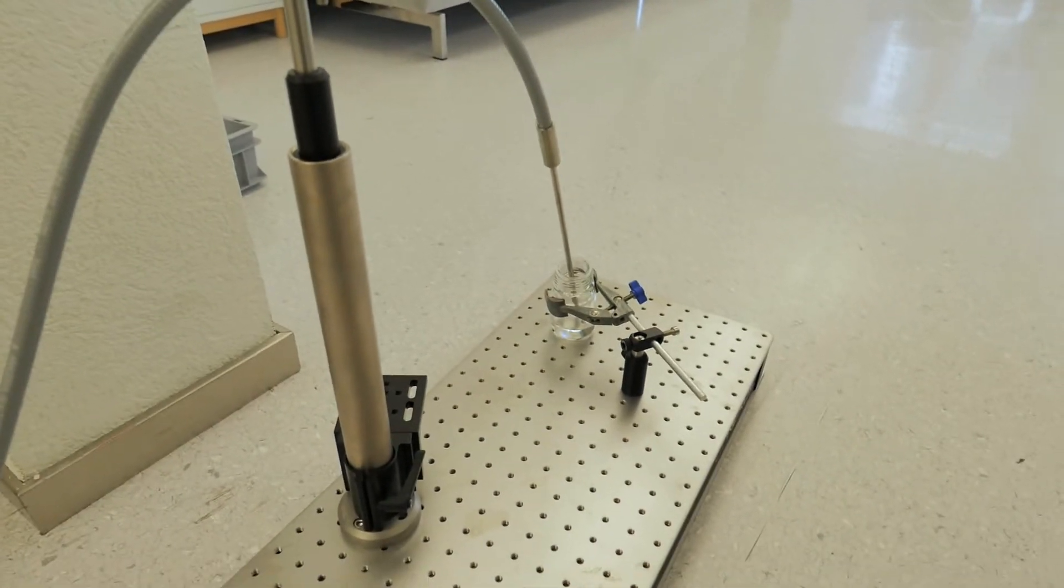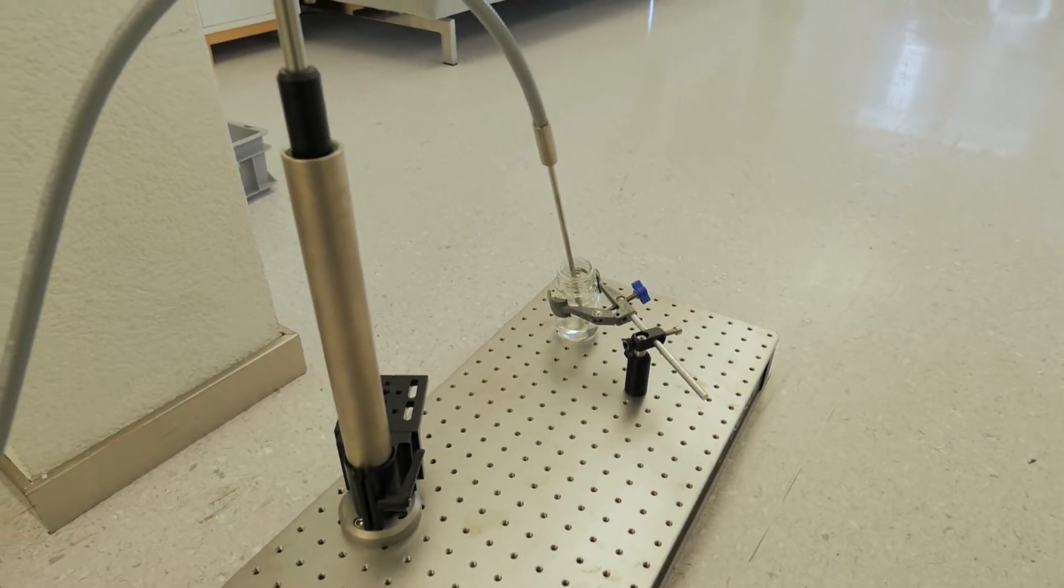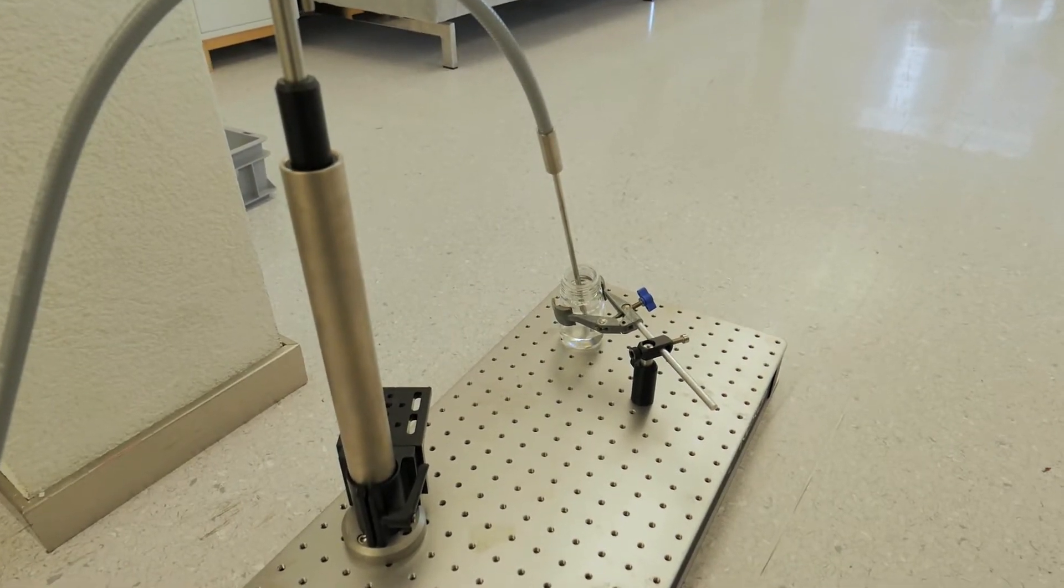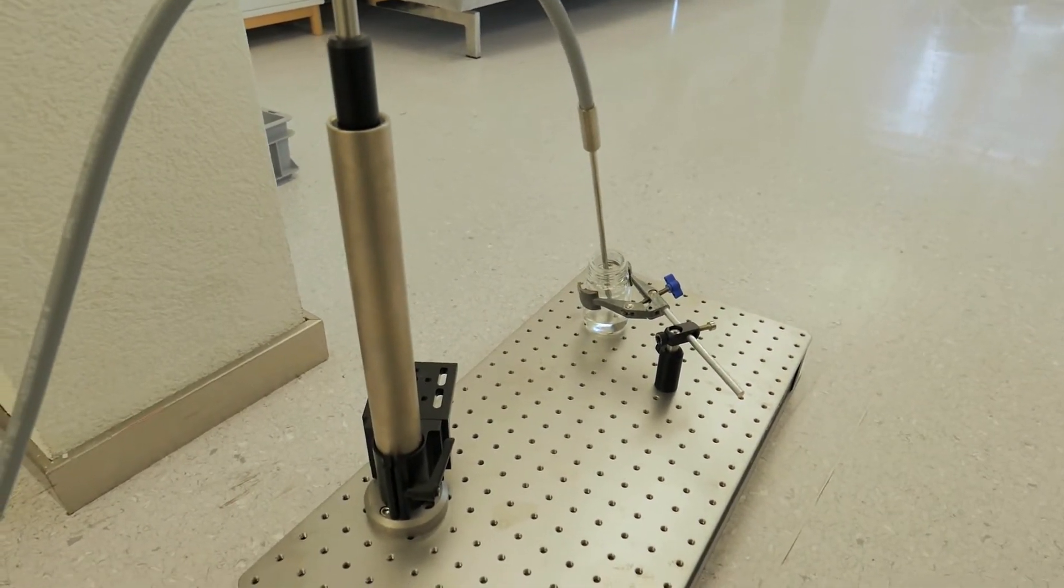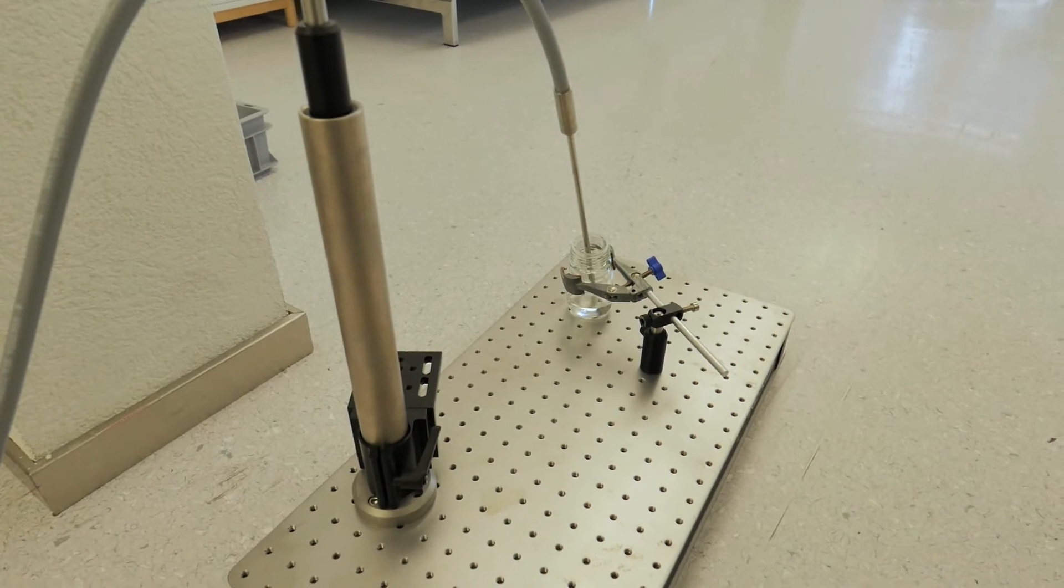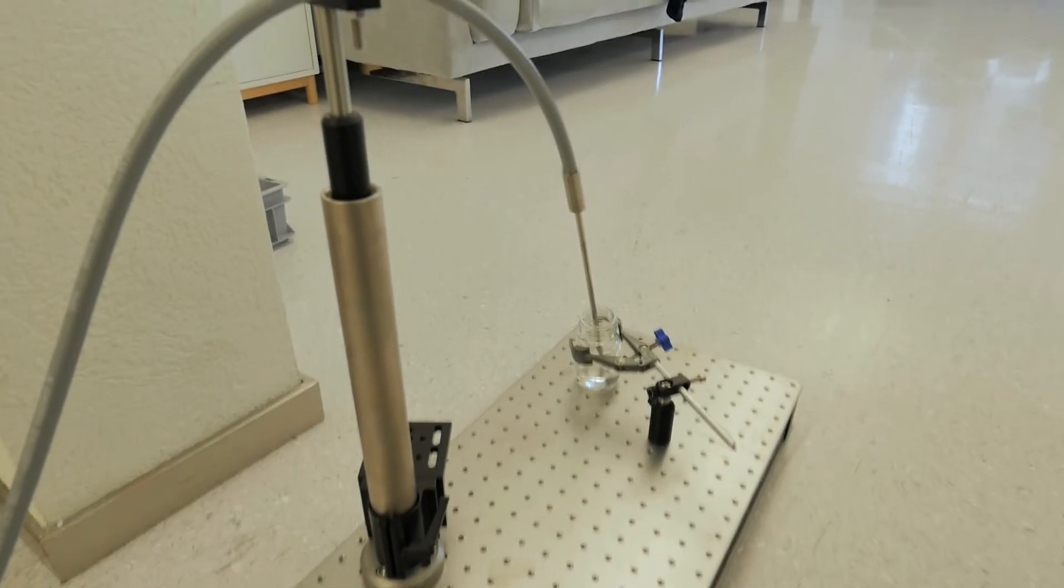I haven't checked any record books, but I believe this is one of the longest mid-infrared fibers in the world at the moment. The results I showed you before were measured through this fiber, so we're very pleased with that.